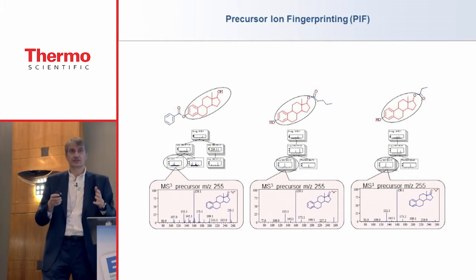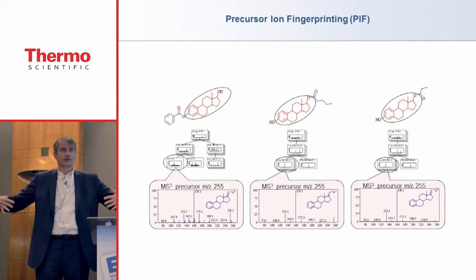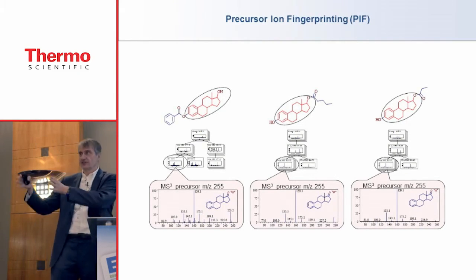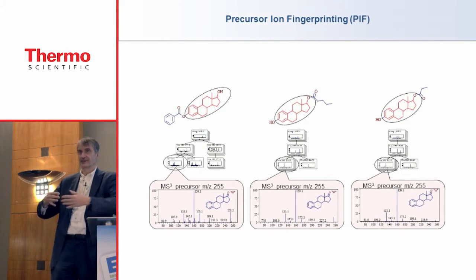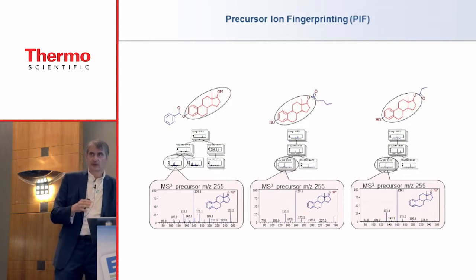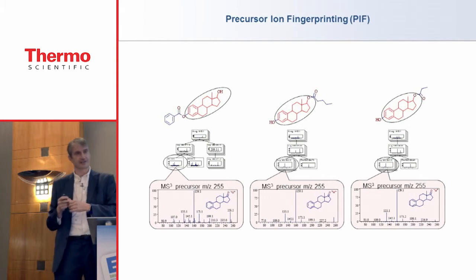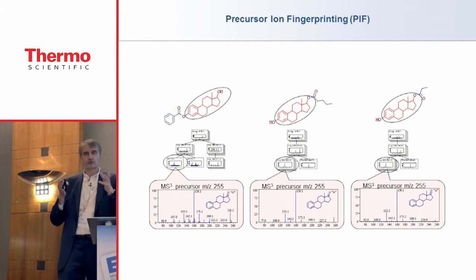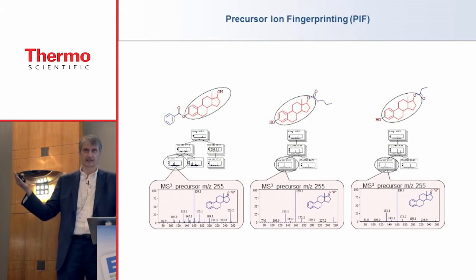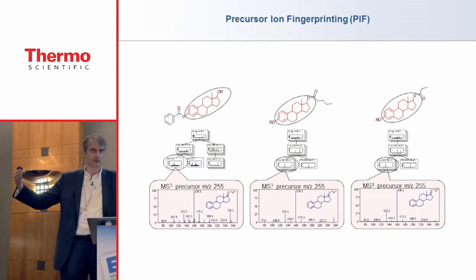And this is the reason why we build very rich spectral trees, because we would like to build a database of substructures. If we cannot identify the structure itself, at least we can do substructures. The advantage of this method compared to other computational techniques you are reading in these scientific papers is we are not doing some strange mathematics. We are actually comparing nature against nature. So we are comparing the spectrum of a substructure against the spectrum of a substructure.